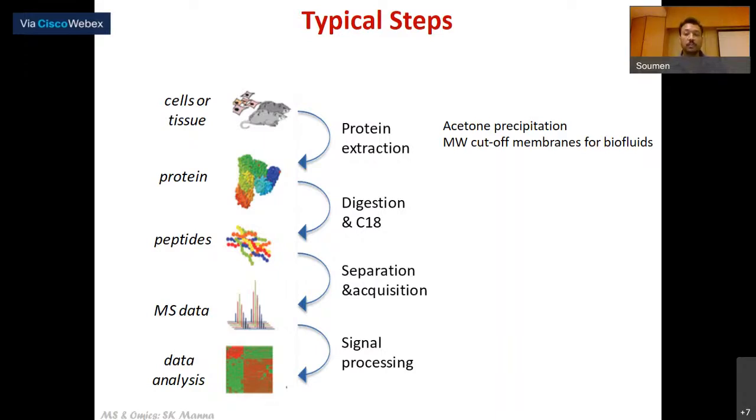As we know, in case of MALDI, you will mostly get singly charged species. You get doubly or triply charged species, but they are generally very low. On the other hand, electrospray ionization, as we have discussed, can do multiple charging, and multiple charging has an advantage in terms of fragmentation, which, I hope I have one slide where we'll show an example, can help generate a more informative spectrum.